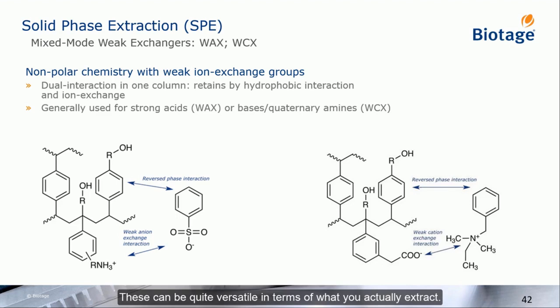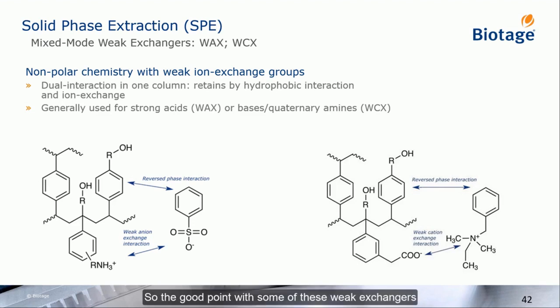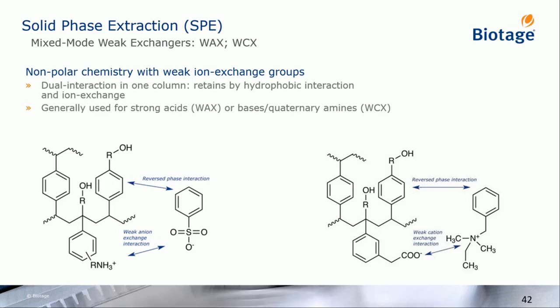These can be quite versatile in terms of what you actually extract. So the good point with some of these weak exchanges, you have the option of running pH control where the retention is again dictated by pH, but you can turn the charge on your analytes on or off, and also on the phase. So pH control is a bit more critical for retention, but also then it does give you the option to be able to elute in an appropriate pH control if you have sensitive analytes.